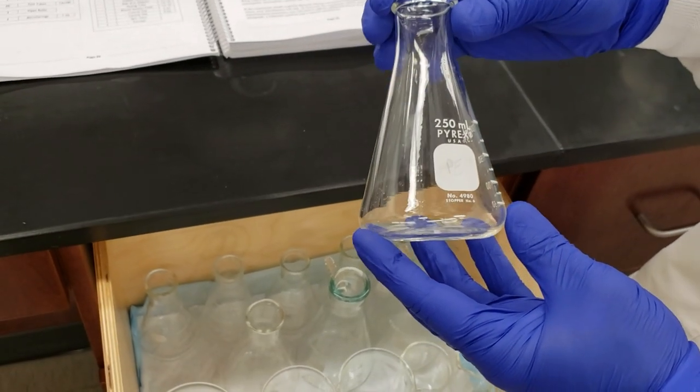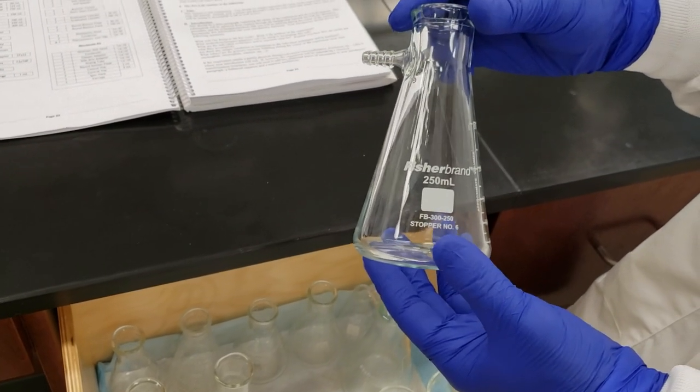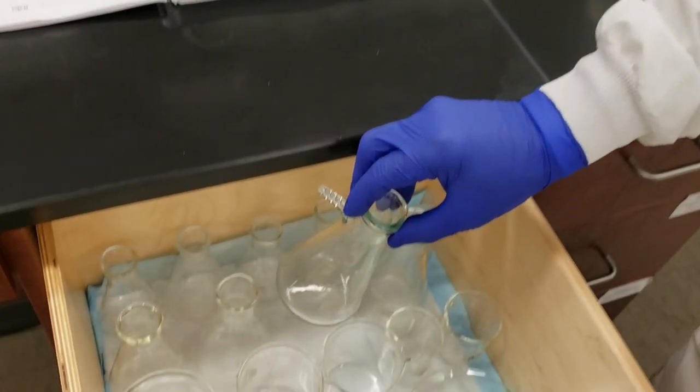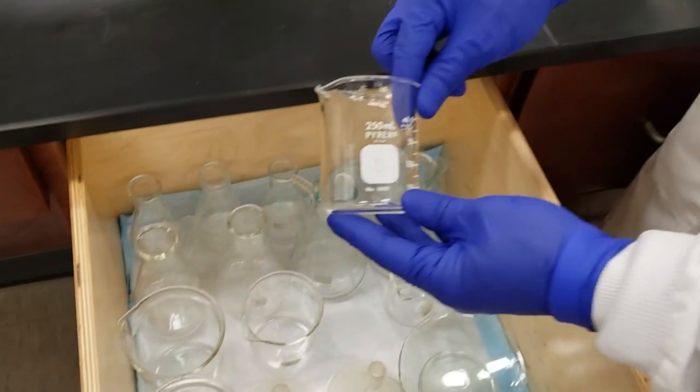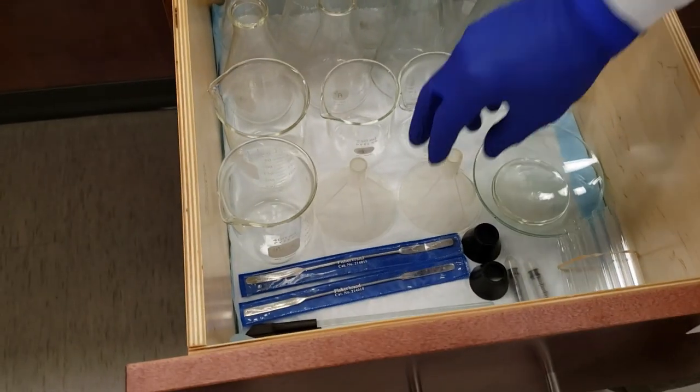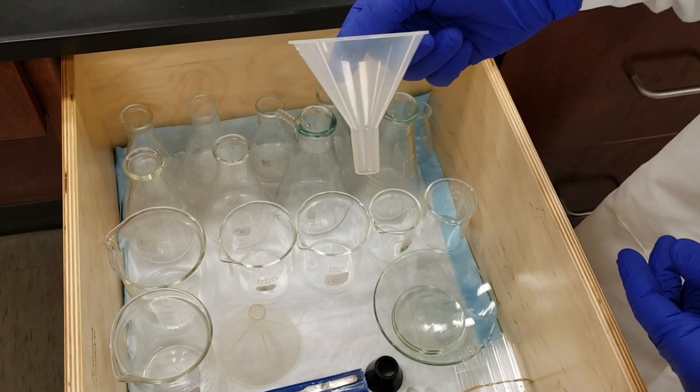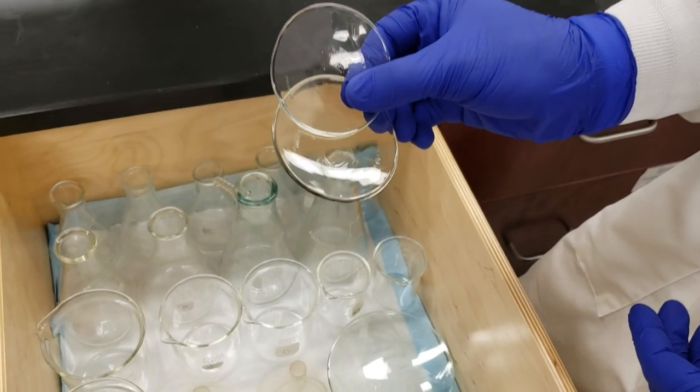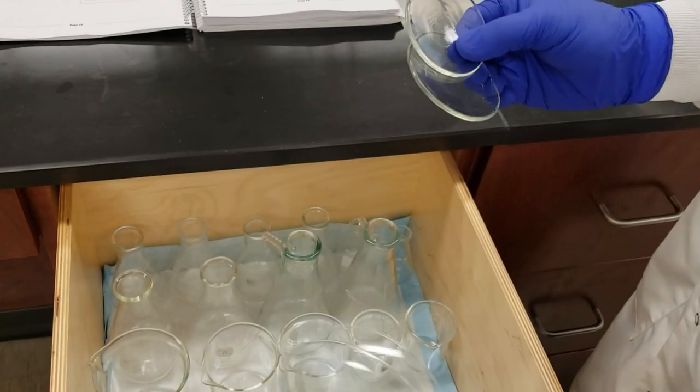The last of our flasks is our filter flask, a 250 mL with a vacuum adapter attached to the side for suction filtration. We've got two of those. We have three different beaker sizes: 100 mL, 250 mL, and 400 mL. Along with our beakers, we have powder funnels to pour liquids and solids. We have a series of watch glasses, two smaller and two larger, used to weigh out starting materials and final products.